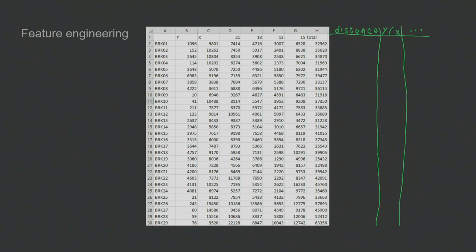Also, there's one extra step that we do that helps a lot for noise reduction, which we call technical replicates. Basically, 4 barcodes is 4 copies of the same person. And we do that to make the whole thing more robust to noise, because there's a lot of noise.